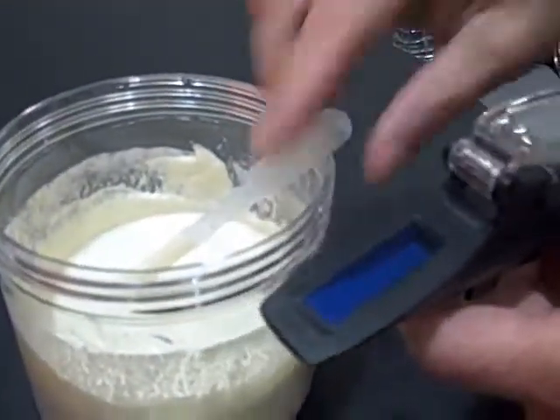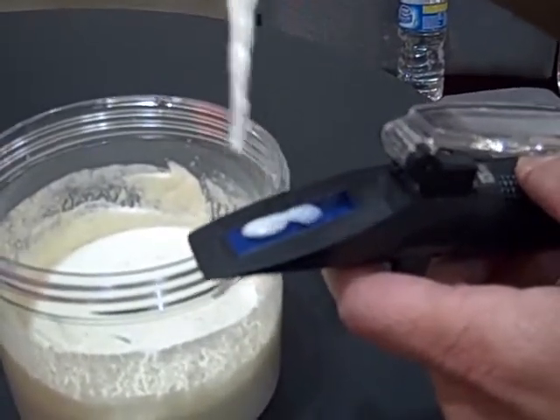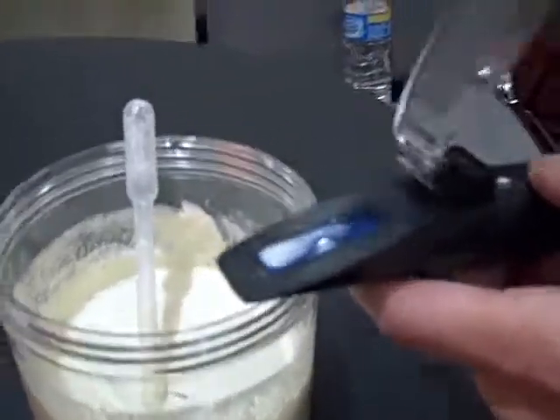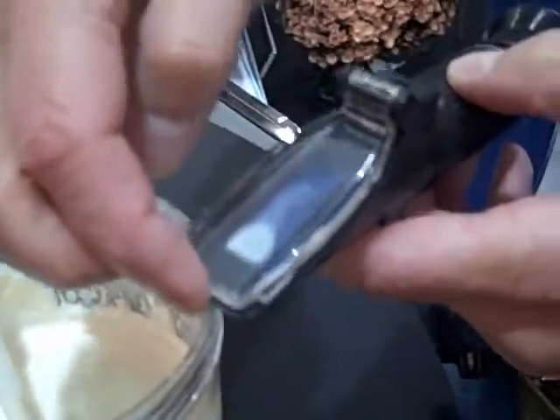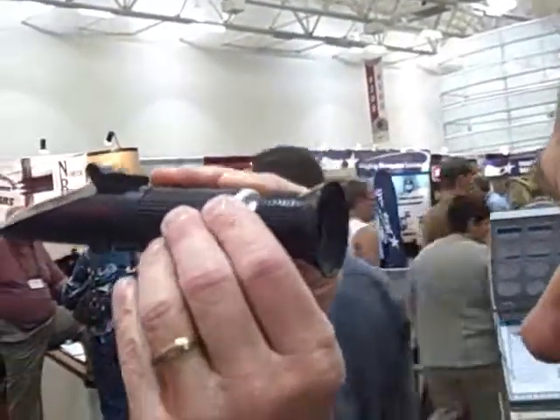To use one of these, it's very simple — simply open the cover, take a couple of drops of colostrum, place them on the window, close the cover, and look into a light source. What we're going to see is a blue line, and that blue line gives us a sliding scale.